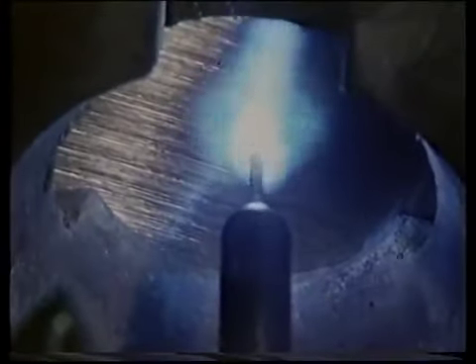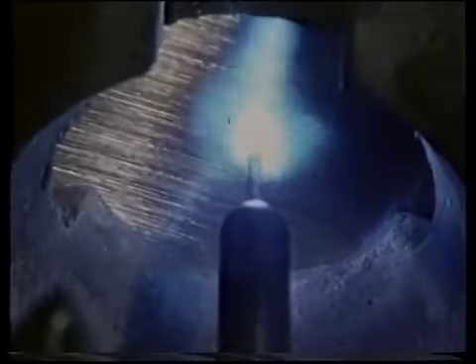Now we have to analyze this sample. If we make the steel one electrode of an electric arc, we can examine the light from this arc. In the spectrum of this light, we find lines. These lines are the atomic spectra of the elements in the steel. So with atomic spectroscopy, we can determine what the steel contains.